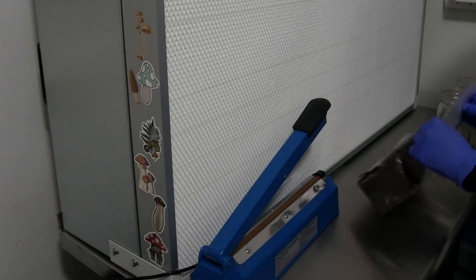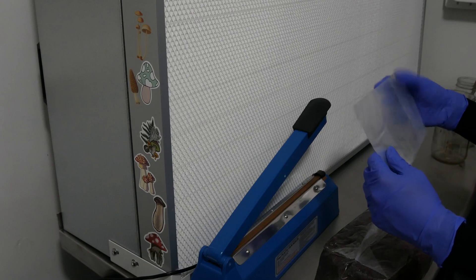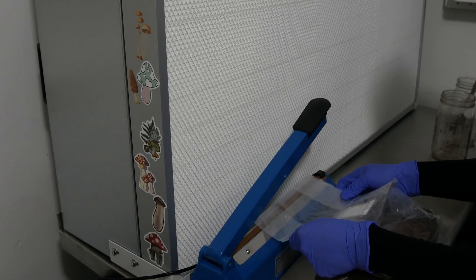When you take them out of the pressure canner, you can either inoculate them with grain spawn and use them right away, or if you want to save them, you can seal the bag up with an impulse sealer and it'll be ready whenever you want to use it. I would suggest using them within two weeks after making them.